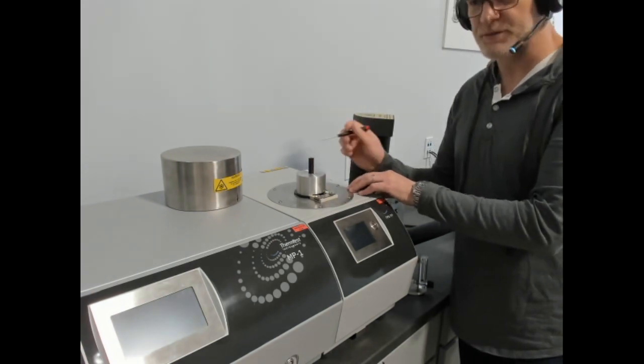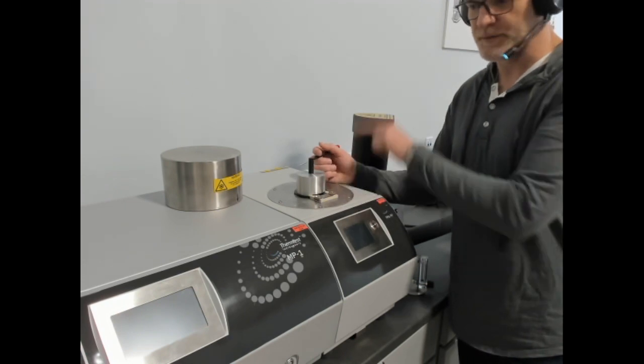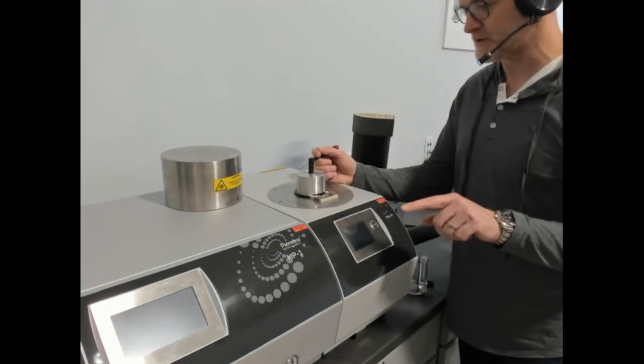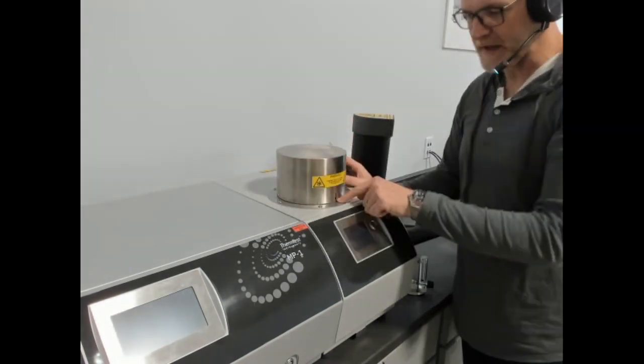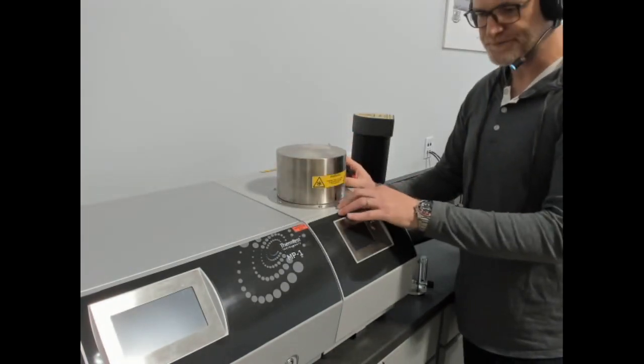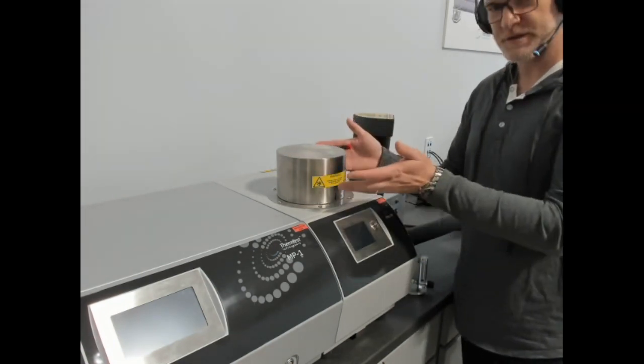So you always have this opposing cold side, and that gives you very fast response when you want to go from hot to cold, so you can have very nice control of temperature. And then this is your safety lid, which has a magnet which will tell the instrument that the lid is on or off, just from a safety point of view. And that's your sample setup.